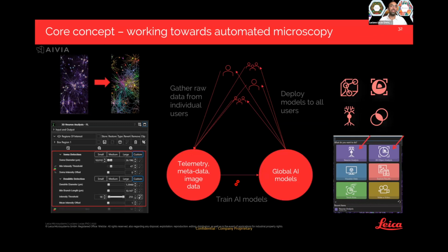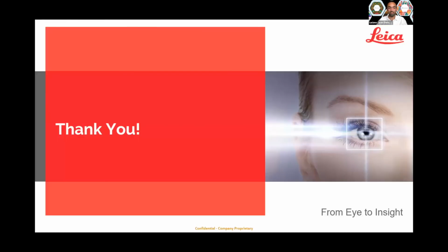What would also be very cool now is to say, okay, microscope, only capture images that are of a particular phenotype, a particular cell event. And that's what this kind of technology also enables us. And that's also what my team, the data and analysis team at Leica, is very interested in. And that's part of the future for sure.